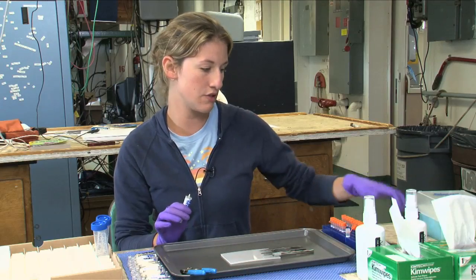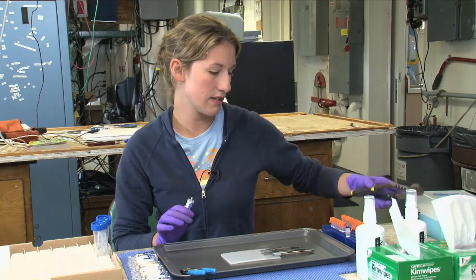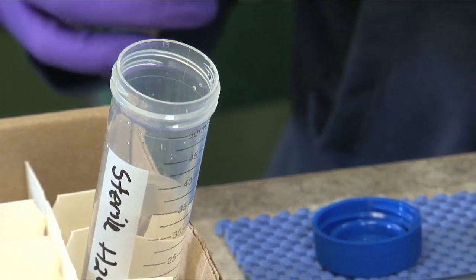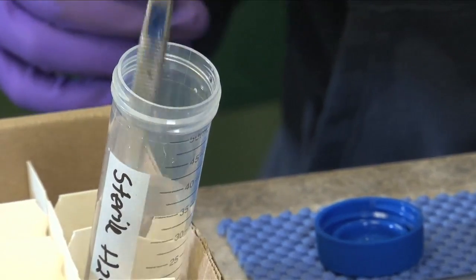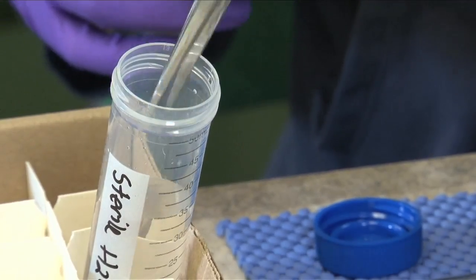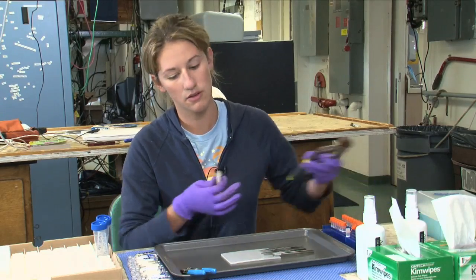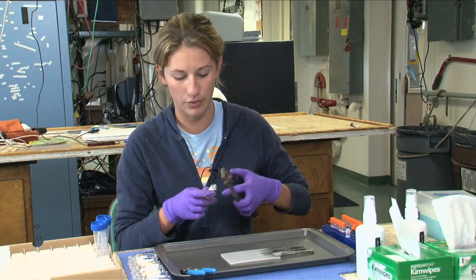So the first thing you do is you want to work with all sterile tools. We have this product called DNA Zap that we've washed everything with, so there's no DNA anywhere, no residue — it's all sterile.